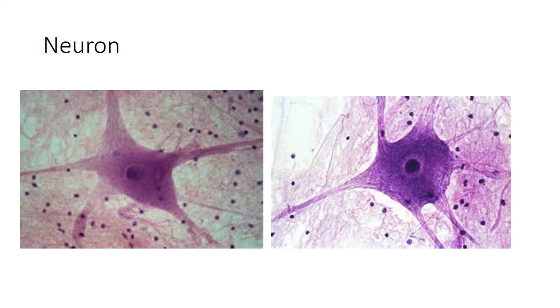Then we have, it's not really connective tissue, then we have a neuron, don't we? These are real easy to figure out. Look at the star-shaped cell. But with a neuron, what are these other extra little bitty cells here? Remember what they were called? Come on. What are these little cells called? Neuroglial cells. Glial cells that actually support the neurons. So big star-shaped cell for conducting impulses.